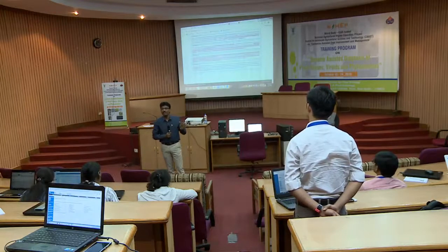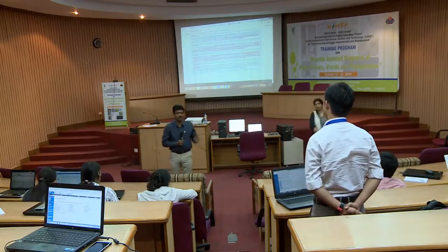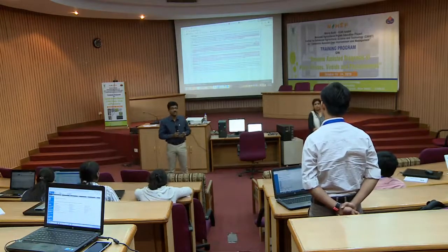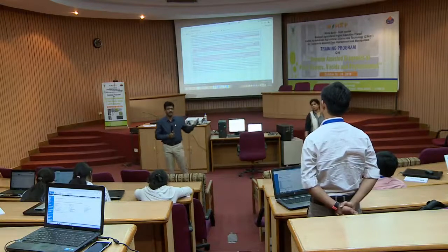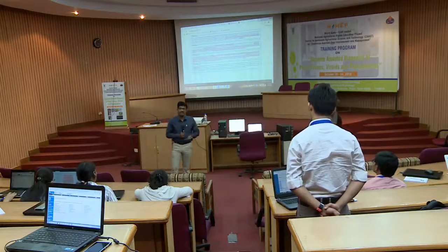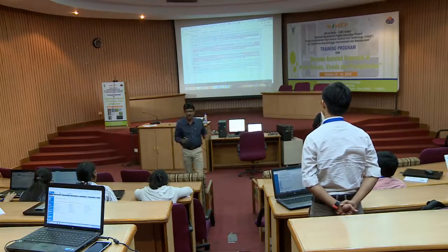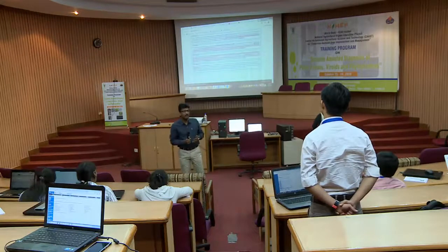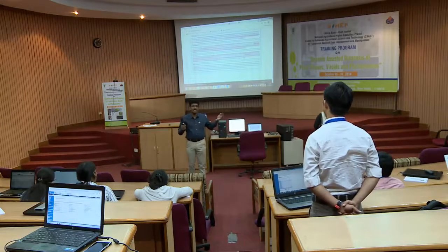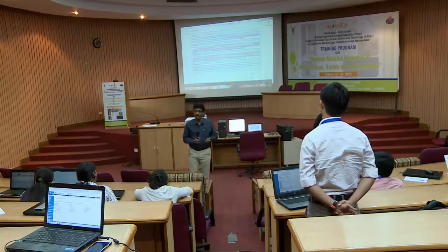I was listening: be transparent, give as much information as possible while making the data sheet of your sequences, so that your data can be referred to by other people. They will be using your data in their analysis. Genomic science is all about involving other people working along similar lines, and only then are the databases in the public domain of any use to anybody, right?